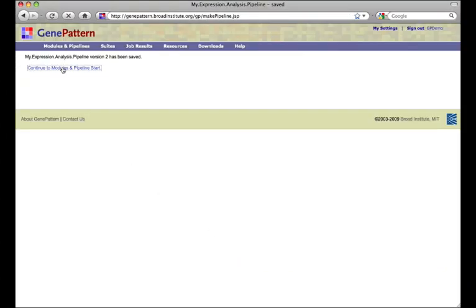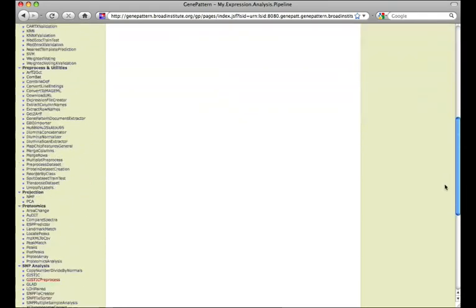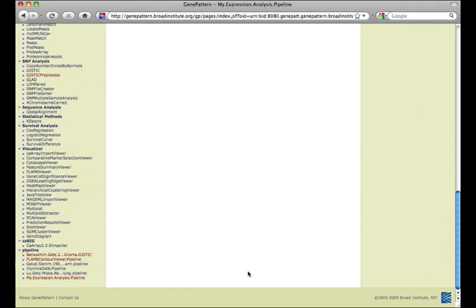The newly created pipeline can now be run, edited, or exported, just as any other pipeline. Please see our user guide at GenePattern.org for more information regarding the management of pipelines.